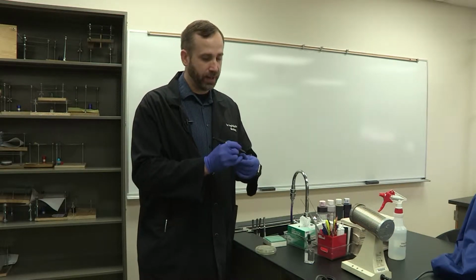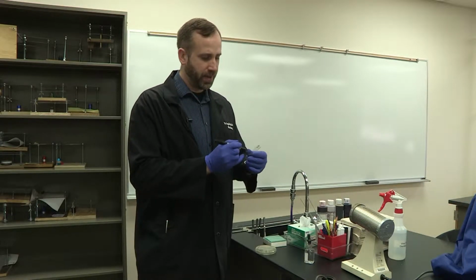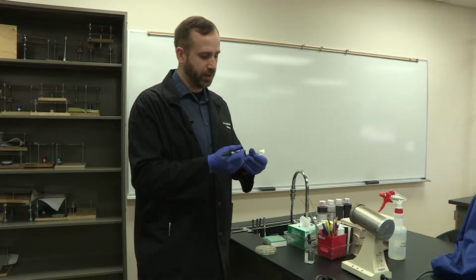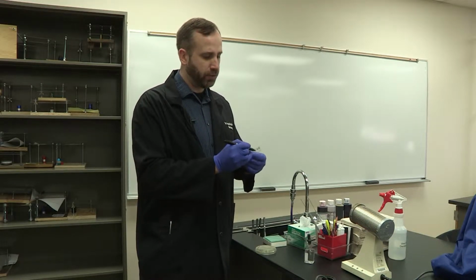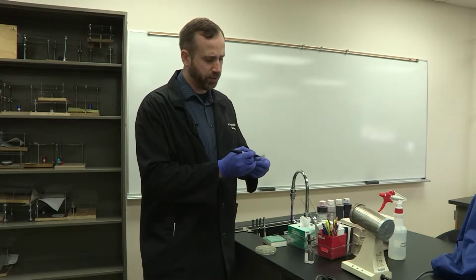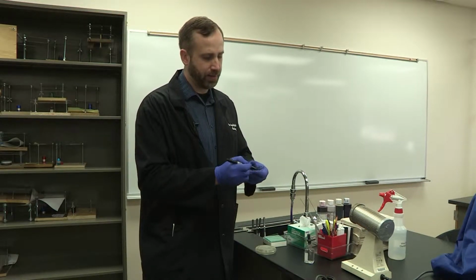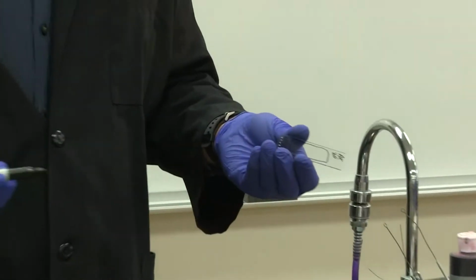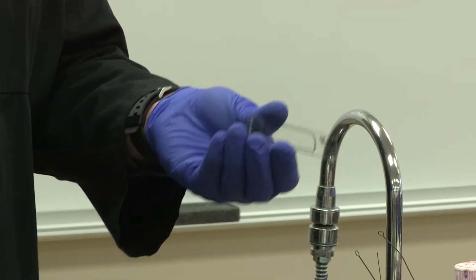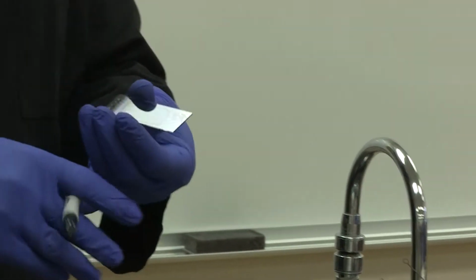Again, retain the naming methodology that you had from your master plates. And then, again, I'm going to do the date. So today's date. And then I'm going to make a circle or square around where I'm going to put the bacteria on the slide, because note that bacteria are pretty clear as soon as you put them on, and they're very, very small, microscopic, so you won't know where you put them unless you mark it.